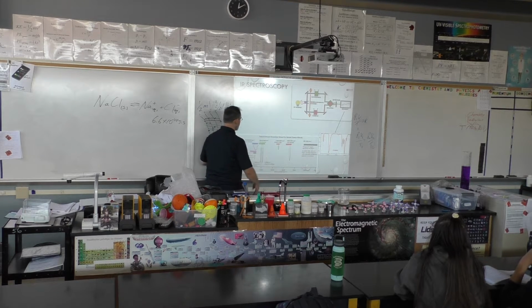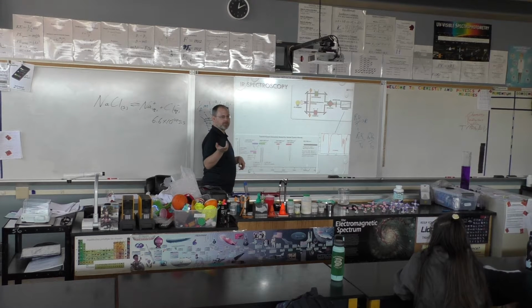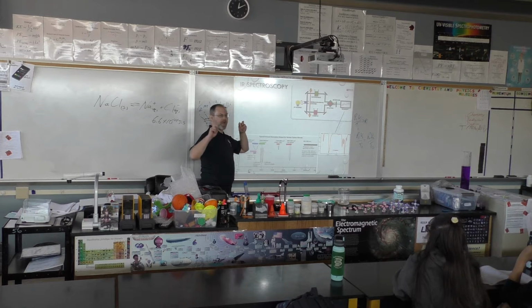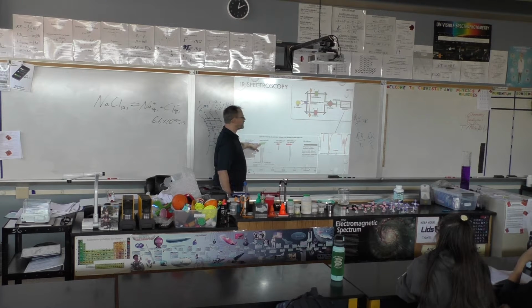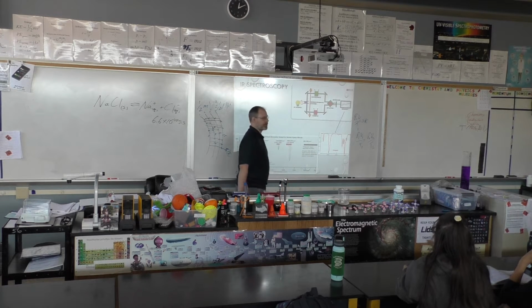And then we have a key. This is a very basic key. The actual key is several pages. Of course, you'll still be on the computer. Me, I had pages I had to go through. So if you get something around 3,400 to 3,200 wave number, which is inverse wavelength, then that's a hydroxide, OH. About 2,800 to around 3,000 is a CH stretch. Everything absorbs around 3,000, or except around 3,000.